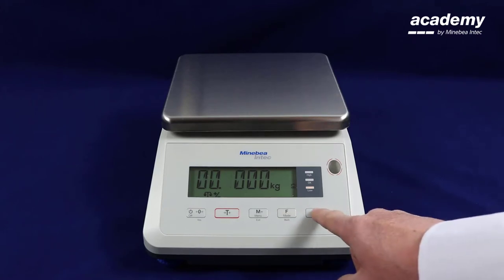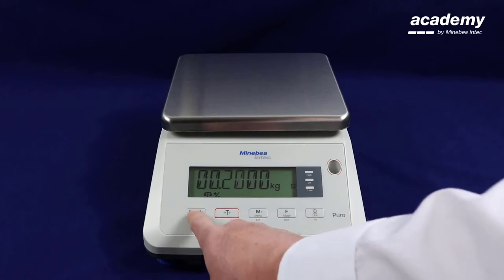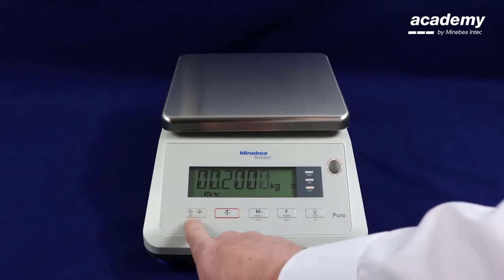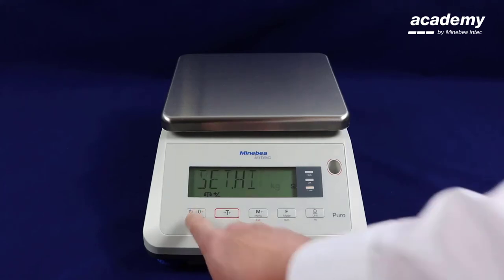When you are happy with the weight on the screen, continue to press yes until all of the digits start to flash. Press yes again to accept.